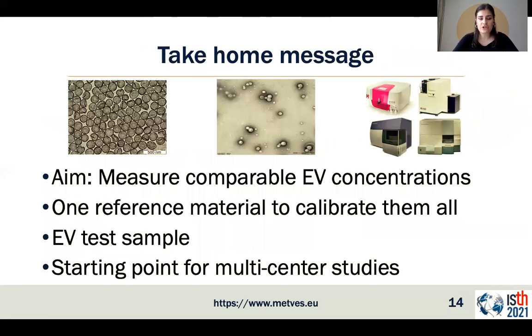And that brings me already to the take-home message. So first of all, I think it's very important, and I hope I brought that across properly, that if you want to explore and exploit EVs as potential biomarkers, we need reliable measurements, and we need to be able to compare our data with other labs. And the METVES project aims to achieve exactly that.